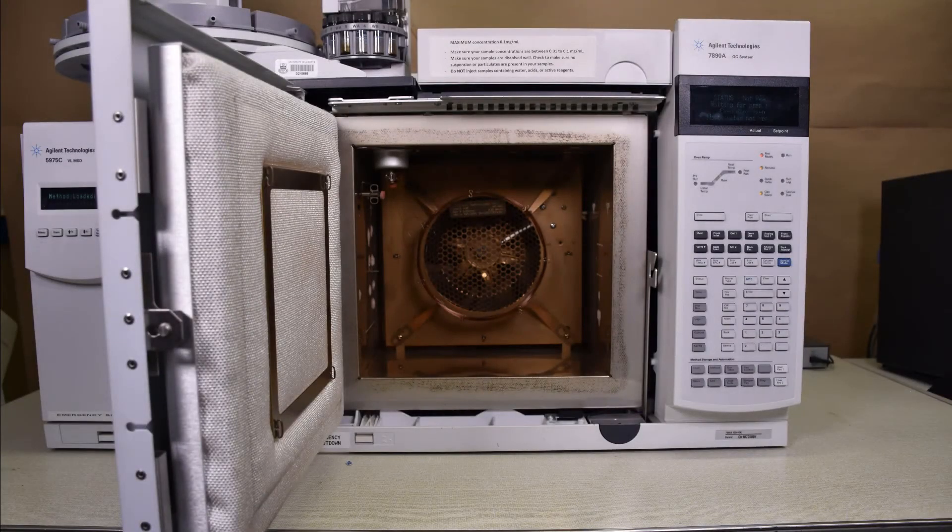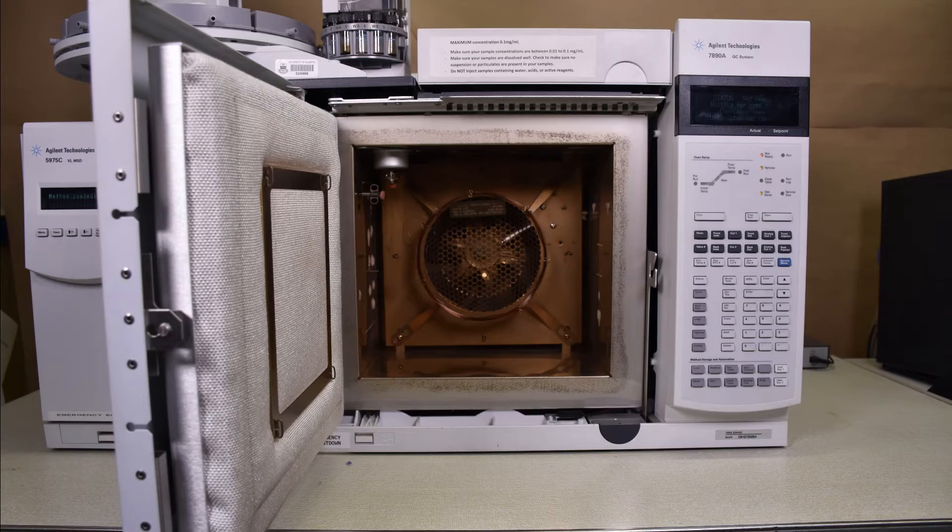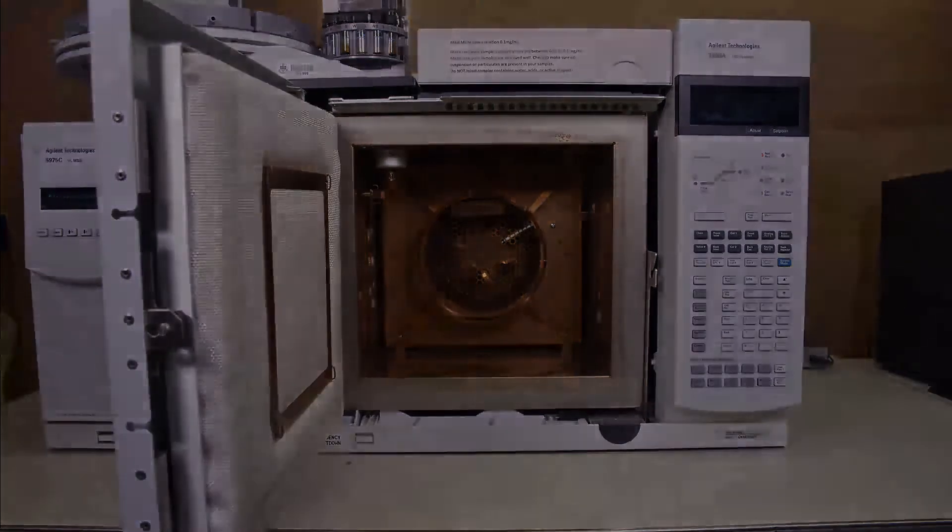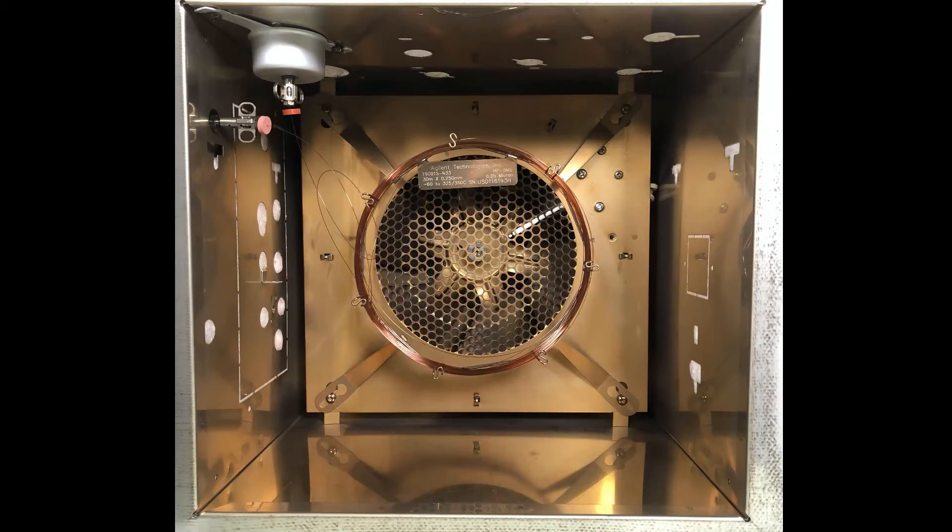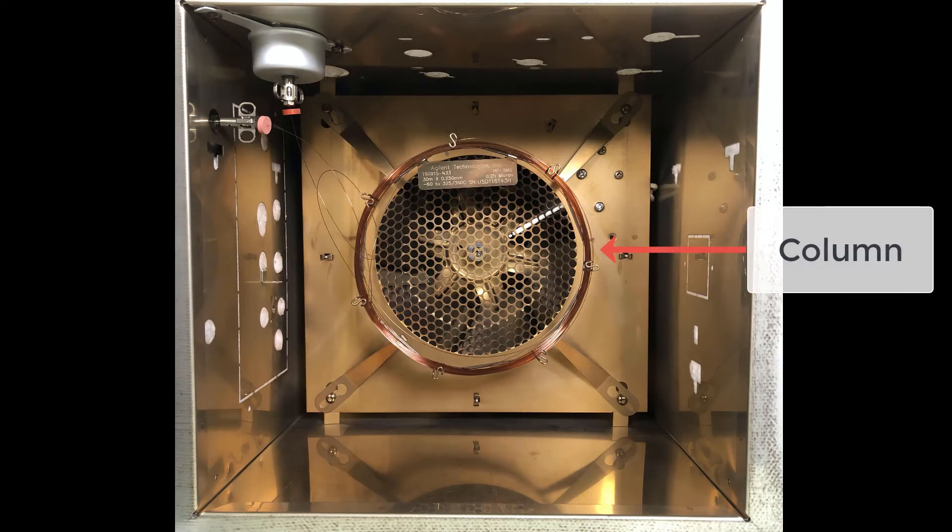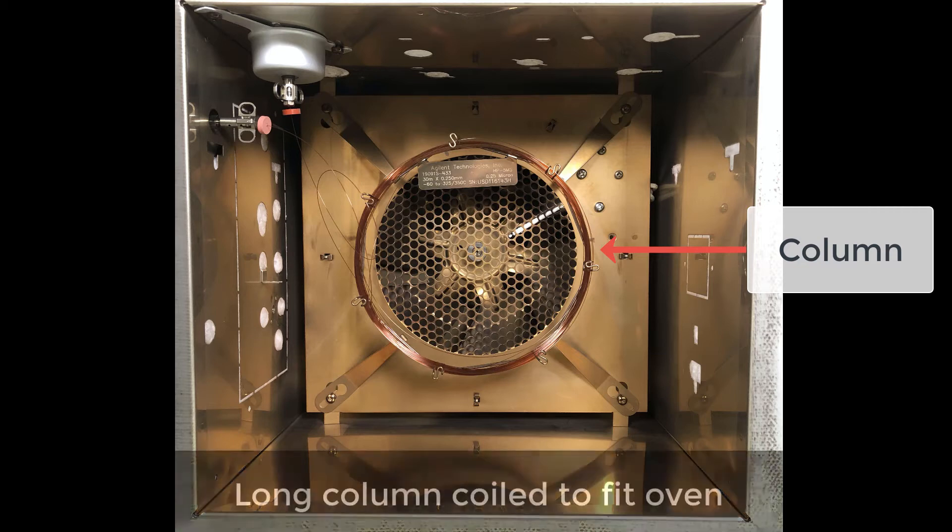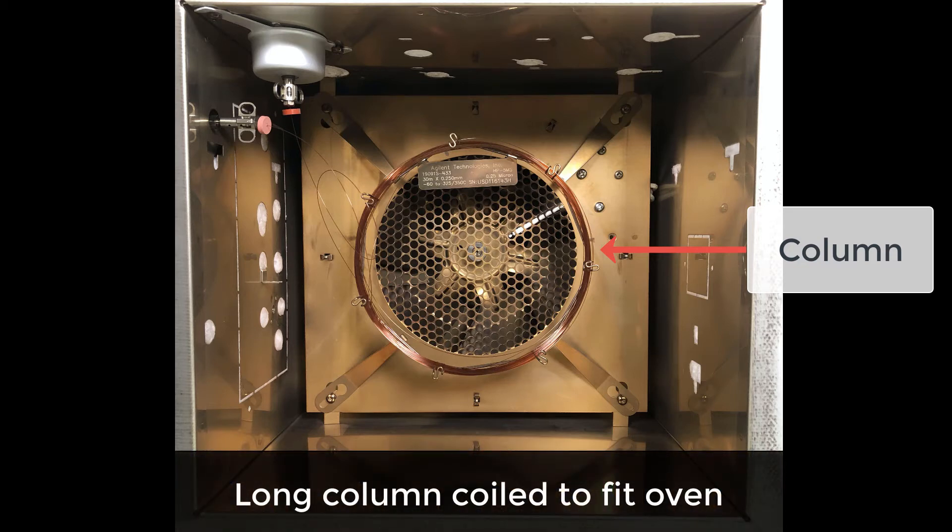The oven and column are the most important part of any GC. The insulated door must be closed when the GC is on. The oven keeps the column at the required temperature. Columns in GC are typically open tubular columns that have an inert gas as the mobile phase and a bound liquid as the stationary phase.